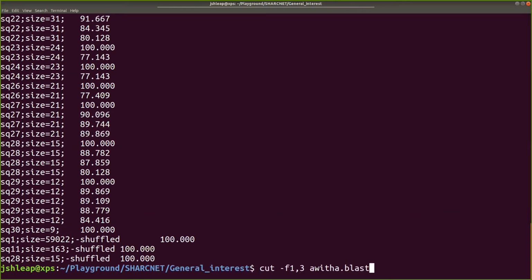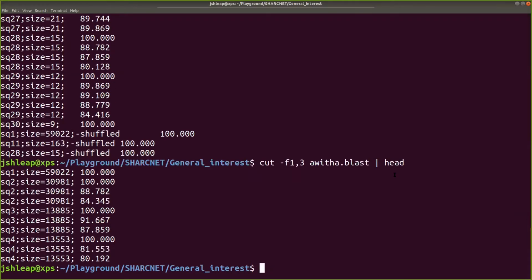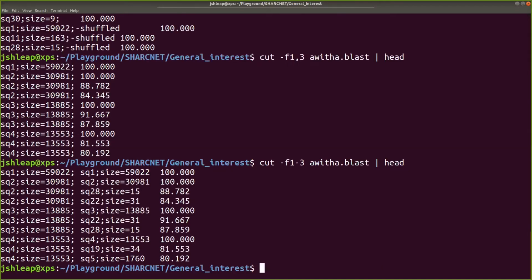And that's going to show you all. I'm going to be using something that is called a pipe just to show you better. A pipe basically takes the output that we just saw and puts it into another command that I'm going to type here, in my case just a simple head. And then we just have a few lines to show. This can be done either as a range. Let's imagine that we only want from 1 to 3, and then we just have 1 to 3. Or you can just put multiple values here.